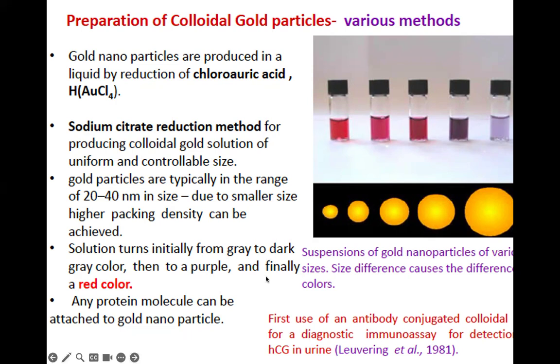This one is very important because this is the key that gives the color on the test line and the control line. If the gold nanoparticle is not of the optimum size, then you will not get a good reading. So every time you want to prepare a new batch of lateral flow, you have to check your stock of gold nanoparticle, whether it is stable or you need to prepare a new one. How do you do that? You need to check using UV-visible spectrophotometry, which tomorrow you will learn how to do.